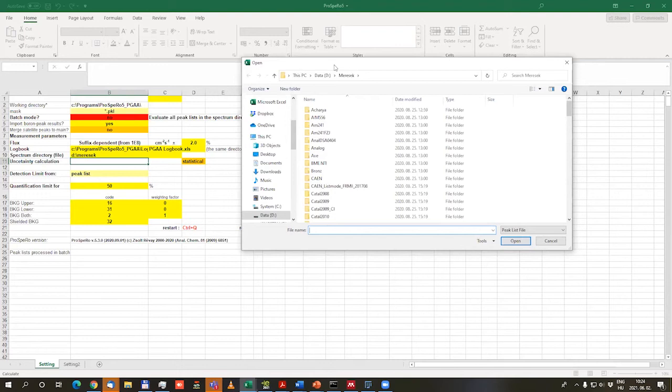And then afterwards, the mass of the element will be computed from all assigned analytical lines. And then the program will make a statistical check and rule out the outliers wherever there is an interference or some poor peak fitting. And the rest will be averaged.